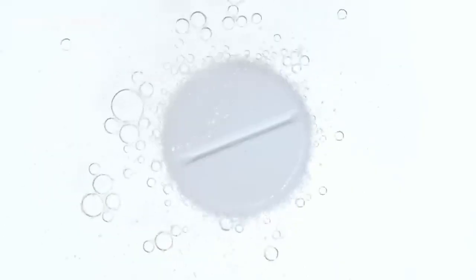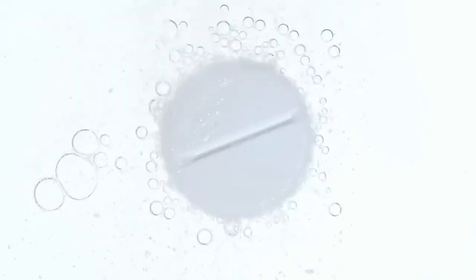We're getting closer and closer to that final perfect aspirin. We filtered out the big chunks of leftover ethanol, but there might still be some tiny impurities clinging to the aspirin crystals. Here we give our aspirin a final rinse with a solvent or water just to be absolutely sure everything unwanted is gone. This extra cleaning step makes the aspirin crystals even purer.